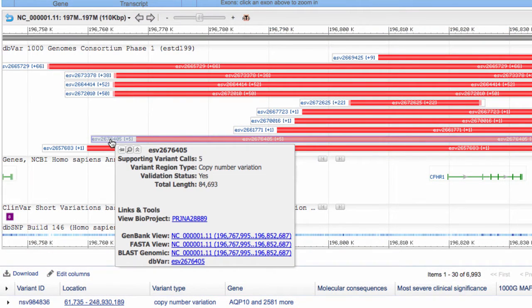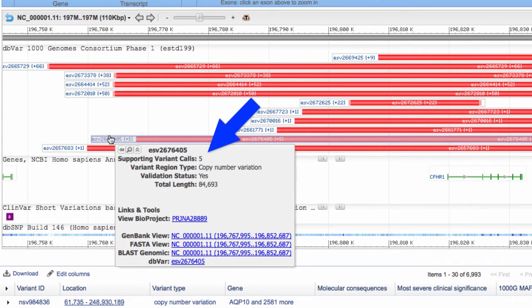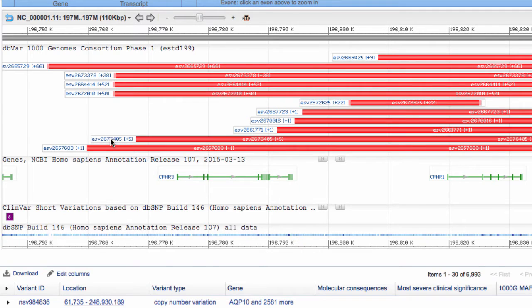As I hover my mouse over this variant, the popup confirms five supported variant calls. And a left click expands the display.